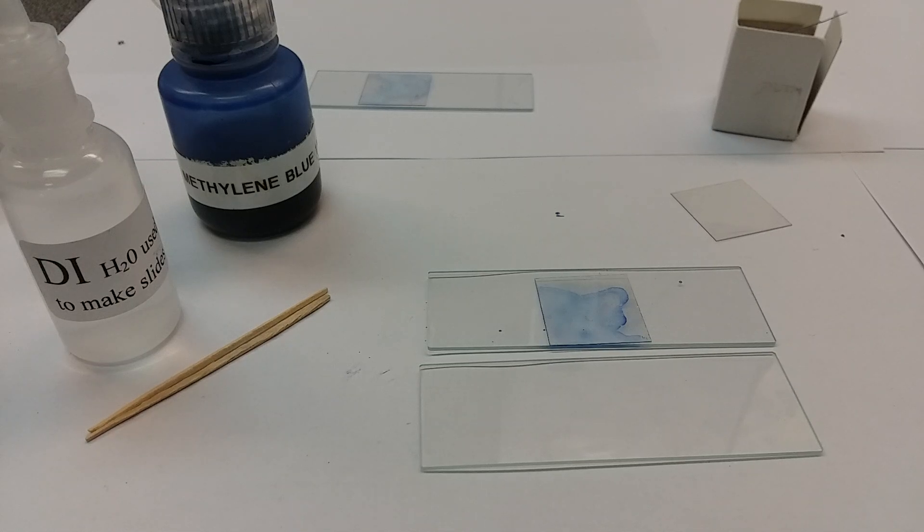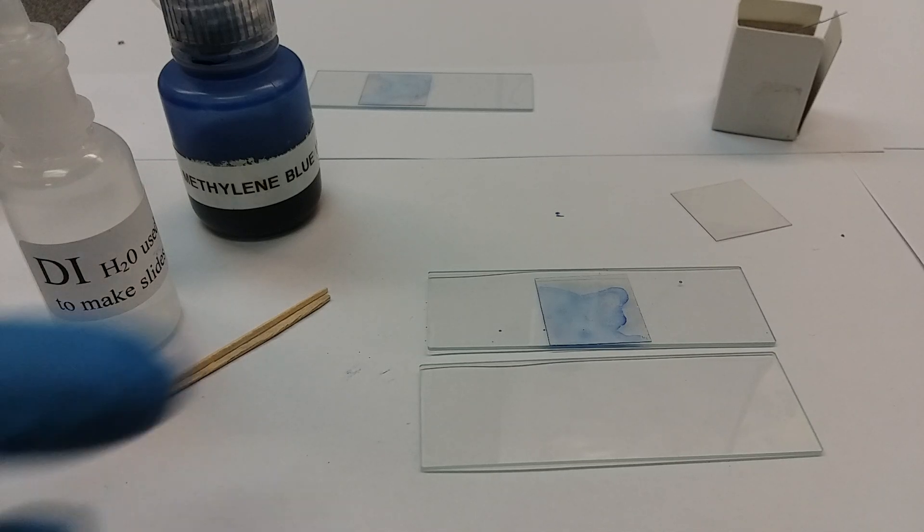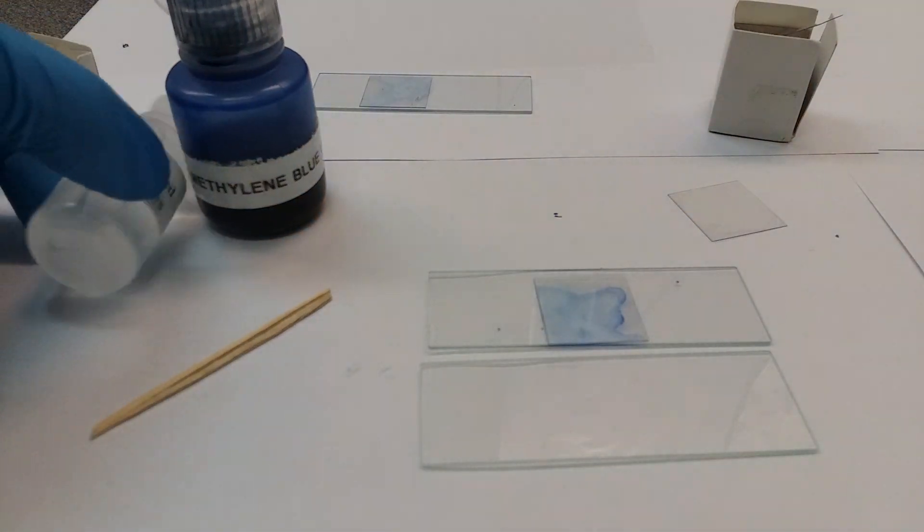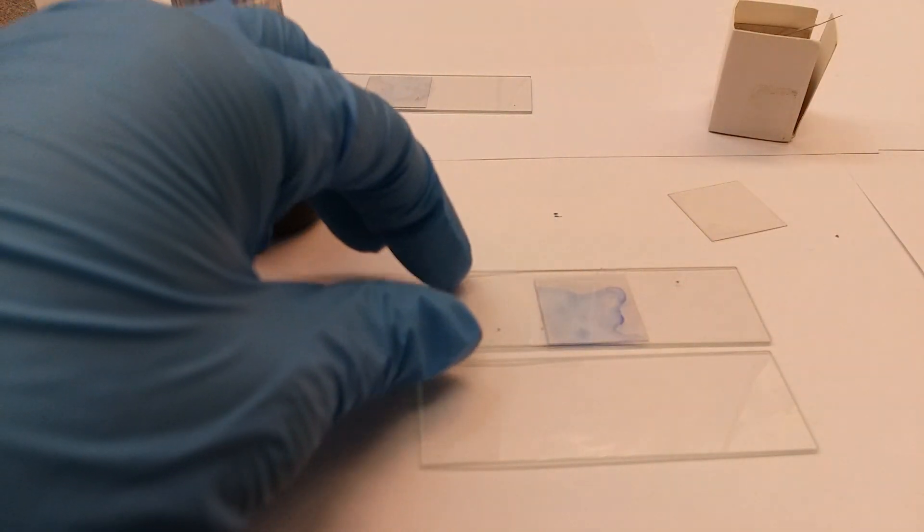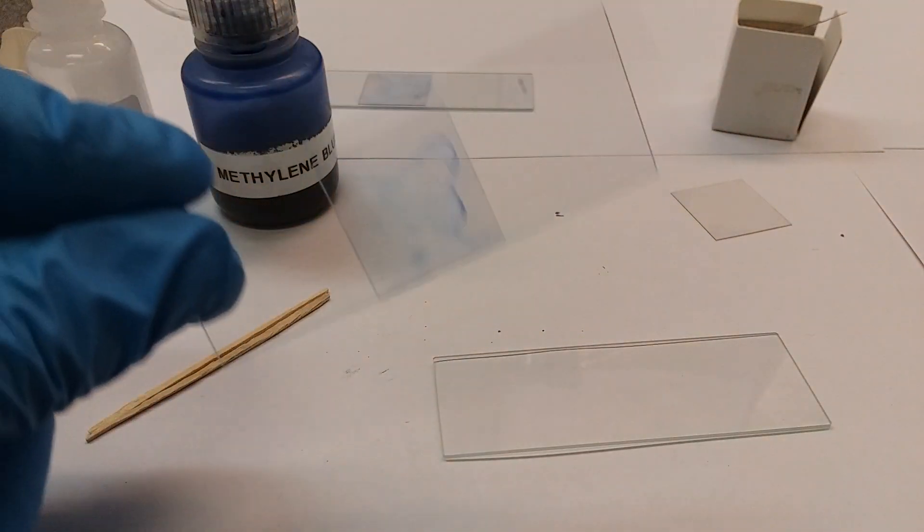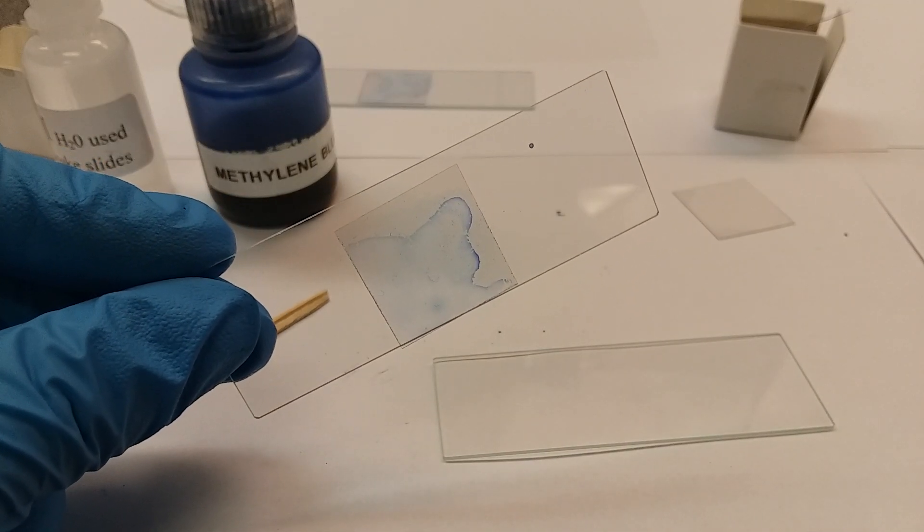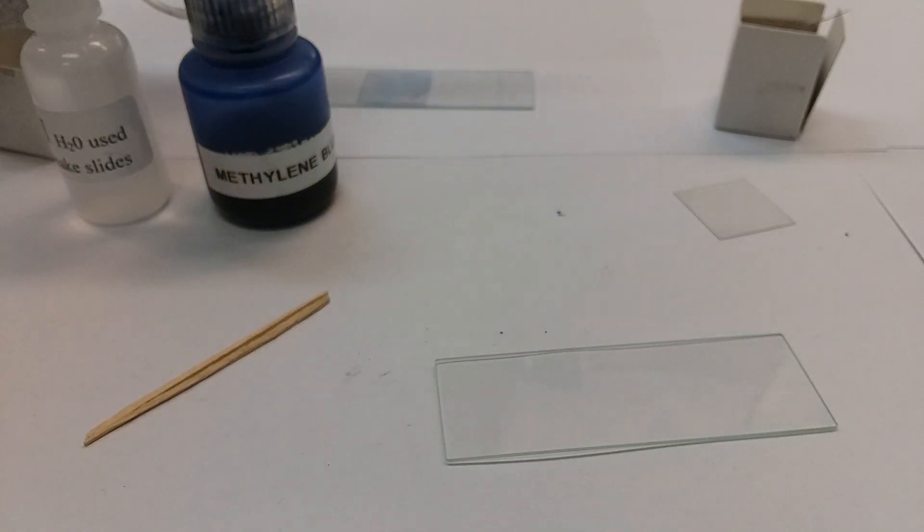Hey guys, this video is on how to make a cheek slide for Lab 7 in the 101 manual. We're trying to make a slide that's going to be stained with methylene blue that's going to have your cheek cells in it. I'm going to lay this over here with the other one I've made.